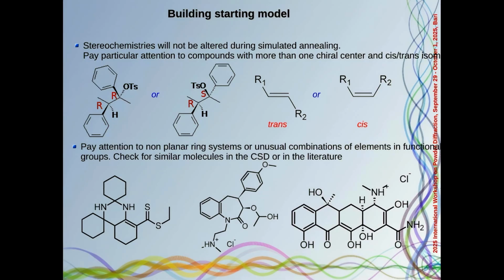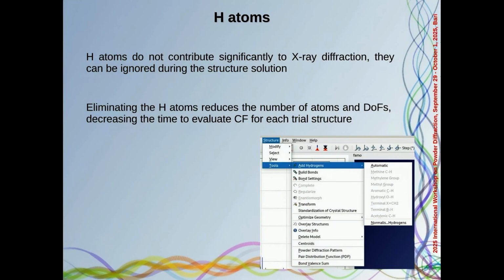Another critical situation, where you have to pay particular attention, is when you have molecules containing non-planar ring systems. I will tell you about this problem in the next slide, not this slide.